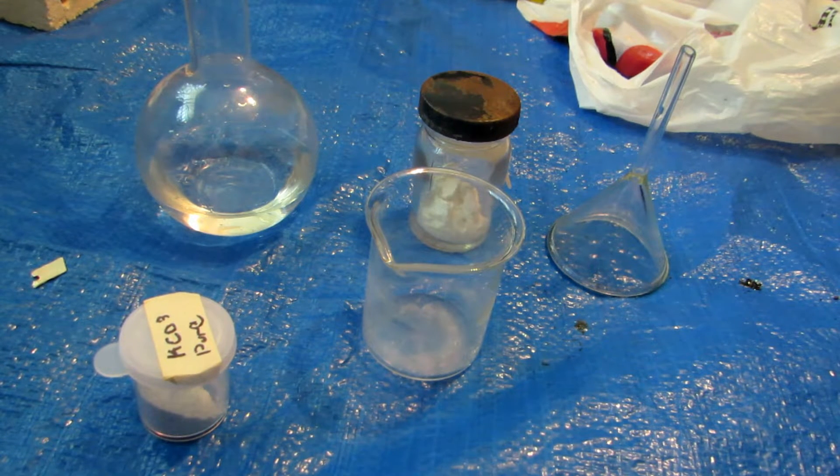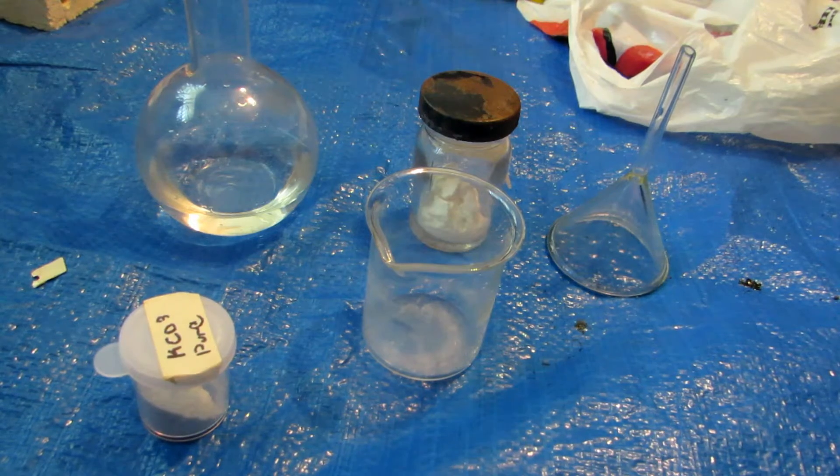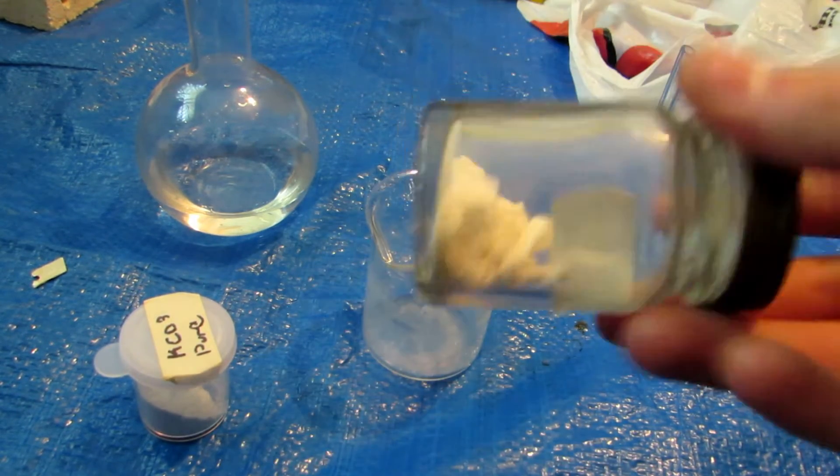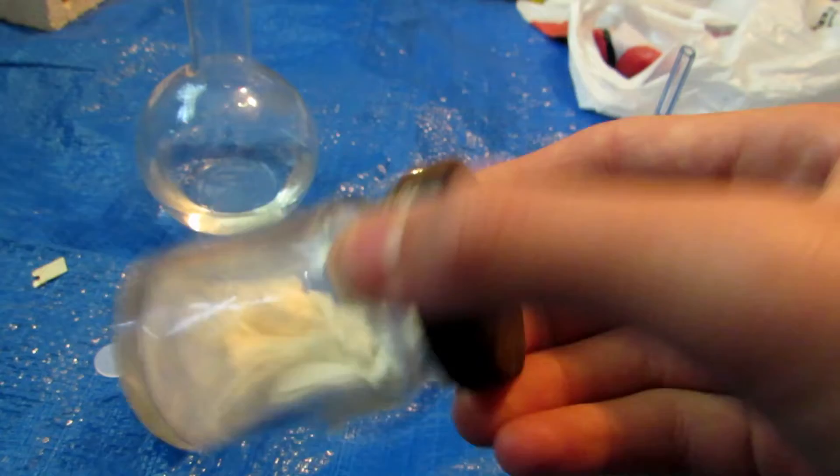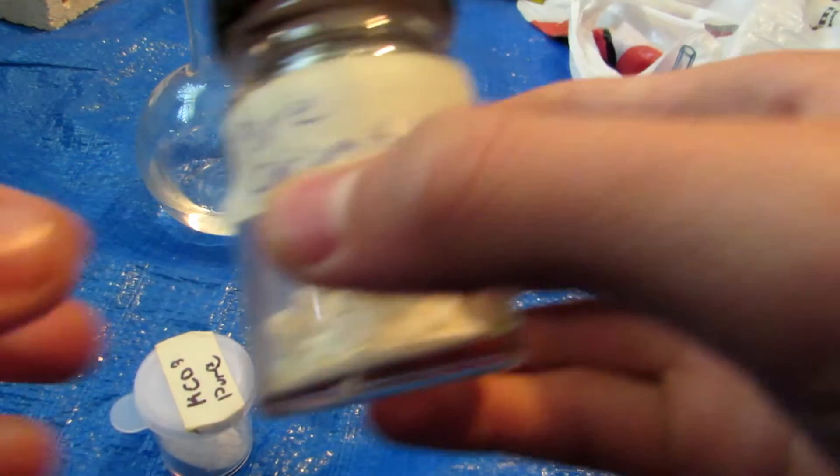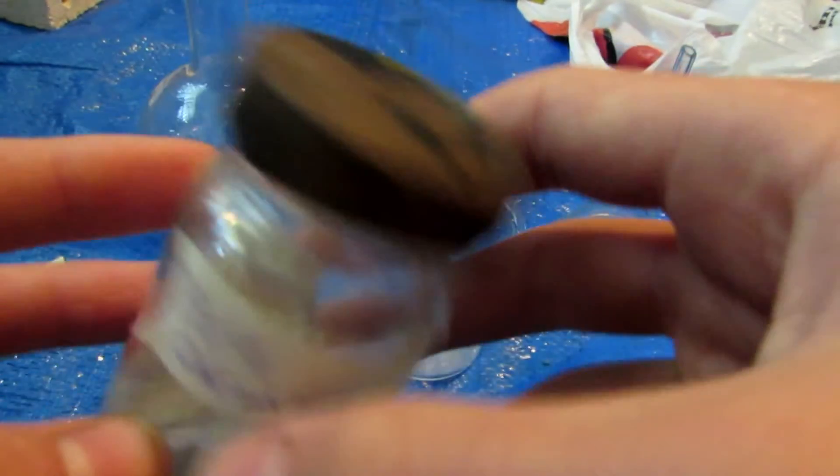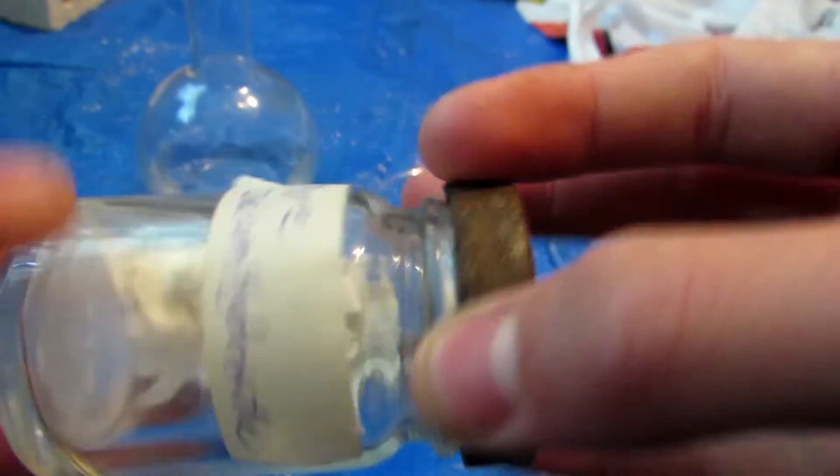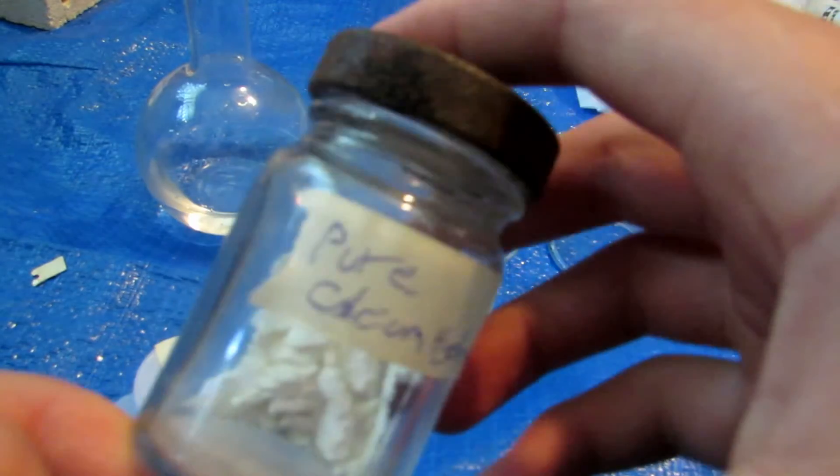Now it's fairly simple to make potassium hydroxide using a simple displacement reaction. So we're only going to need two chemicals, potassium carbonate and this nice calcium hydroxide.